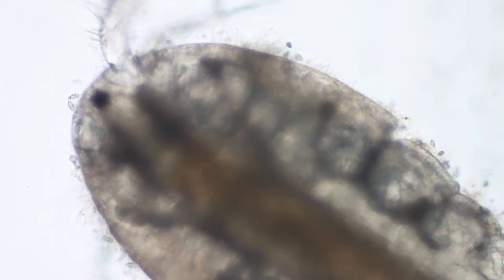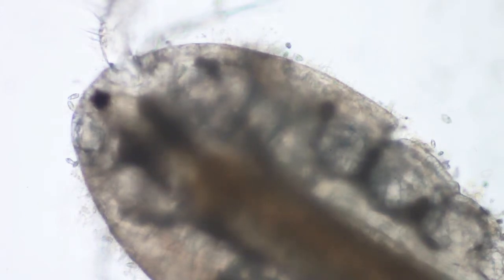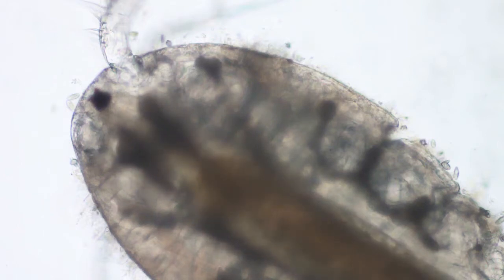He seems to have a... Borgicella or some kind of other bugs hanging onto his shell.